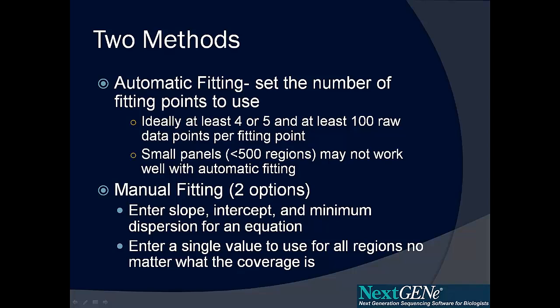But you also have the option to use manual fitting, where you can enter in the parameters for that equation manually to try and fit it by eye. Or what's usually simpler is to enter a single value to use for all regions, so that no matter what the coverage is, you're assuming that there's a certain amount of noise.